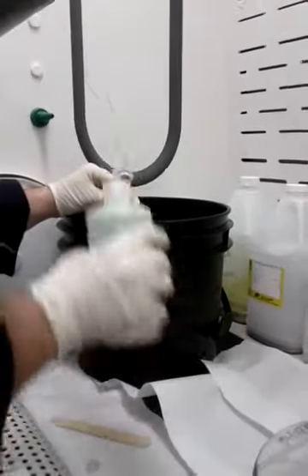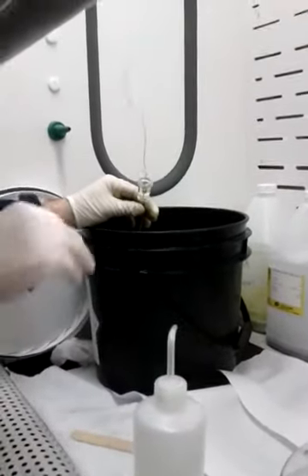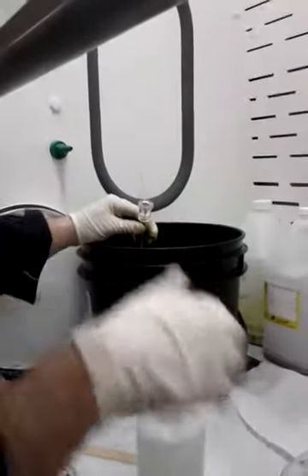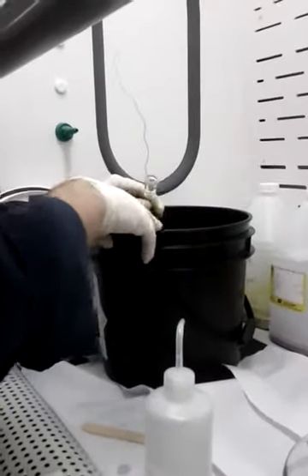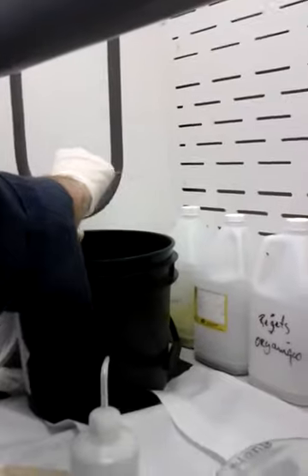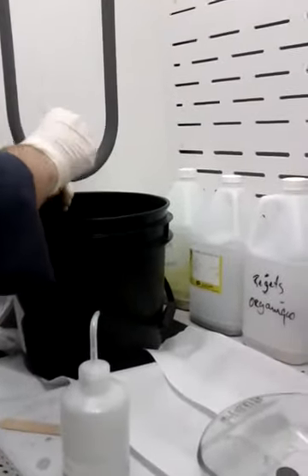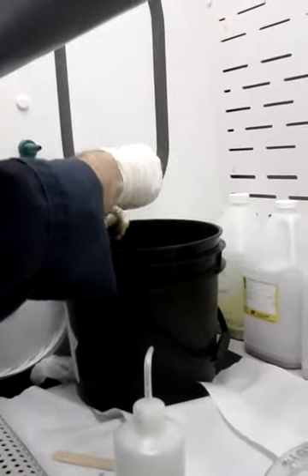They probably increase the temperature to control it. I don't really know exactly how. That's why here we should only put mercury and all the waste in this. Now it's a little bit difficult because it's not rigid enough to go inside.